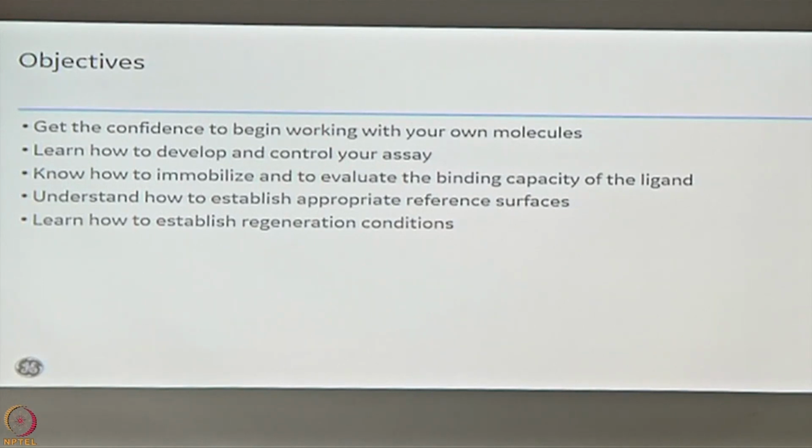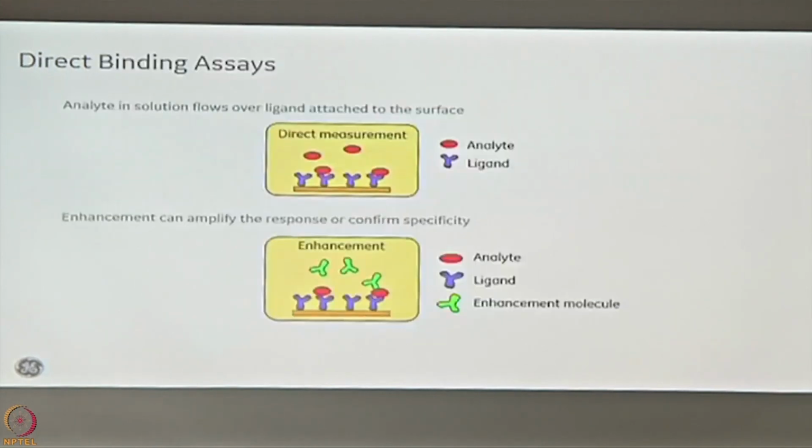How do you optimize the regeneration condition? Because if your regeneration is not perfect, your runs typically do not go so well, right.